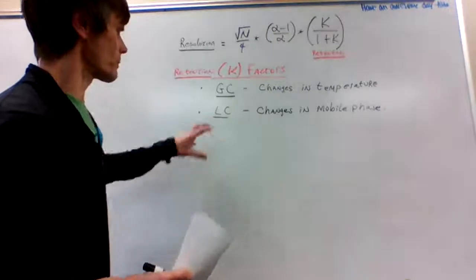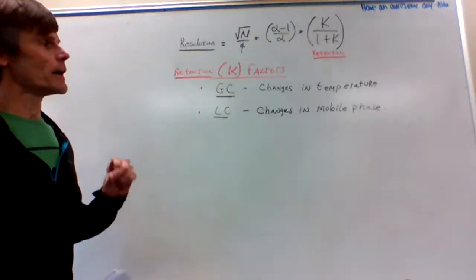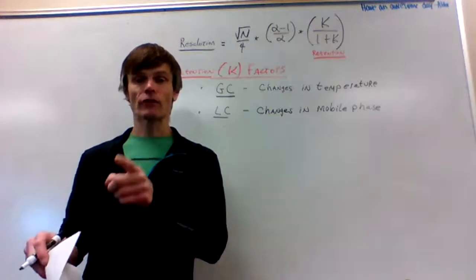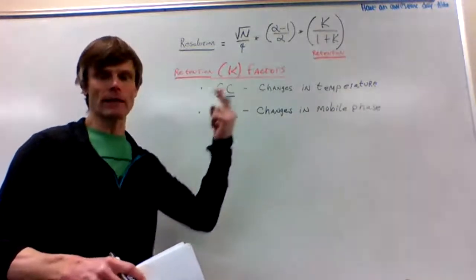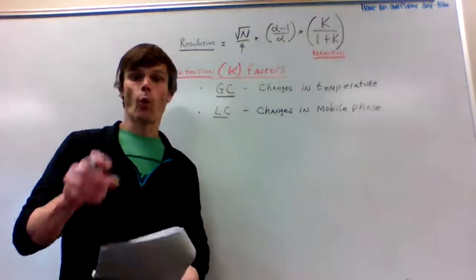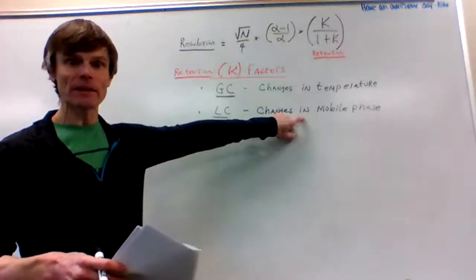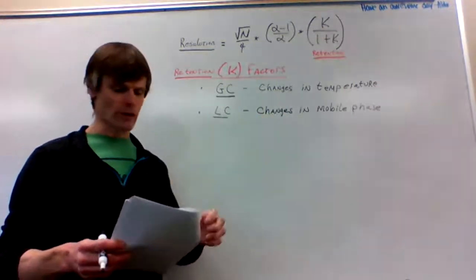What we're going to show when we start showing some of the instruments next in this week is that in liquid chromatography, an important factor about the mobile phase is how polar or nonpolar the mobile phase is in comparison to the stationary phase. If we can change the polarity of our mobile phase in comparison to our stationary phase, we can encourage how long a species will be retained on the stationary phase, because we can encourage it. Does it want to be in the mobile phase or does it not want to be in the mobile phase? Those are the two features that we can change in this case.